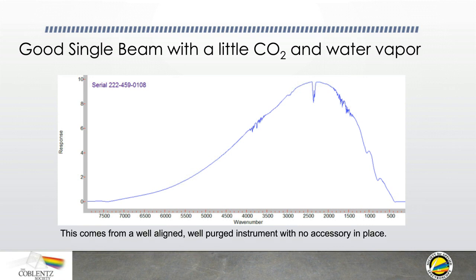In an FTIR, in the interferometer, very minor changes on the order of optical shifts of microns can impact the optical paths of the instrument. If you keep an instrument turned on, the instrument vendors have designed them so that they stay thermostated and the temperature remains the same, and you should be getting a response on Monday that is exactly the same as you get on Tuesday. My recommendation, you should keep the instrument on all the time so that it stays at a constant temperature.